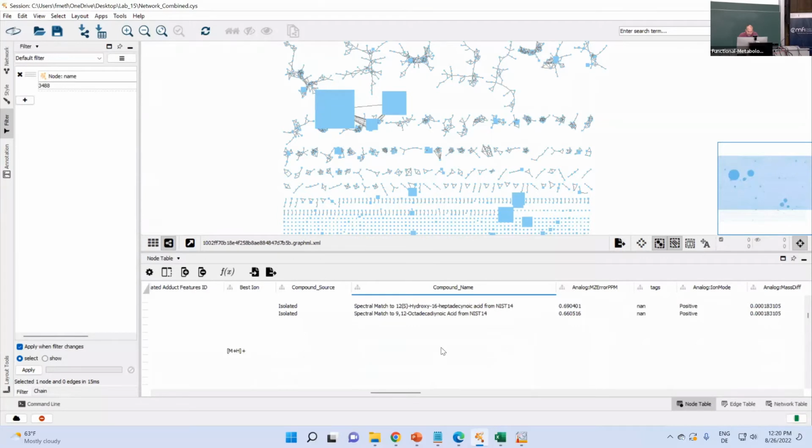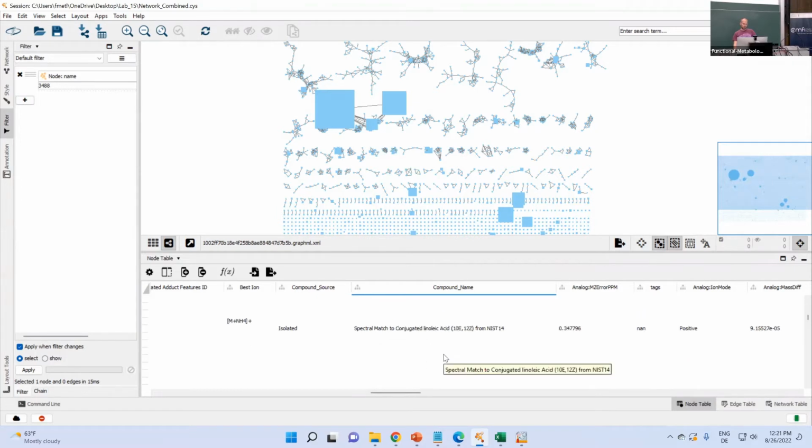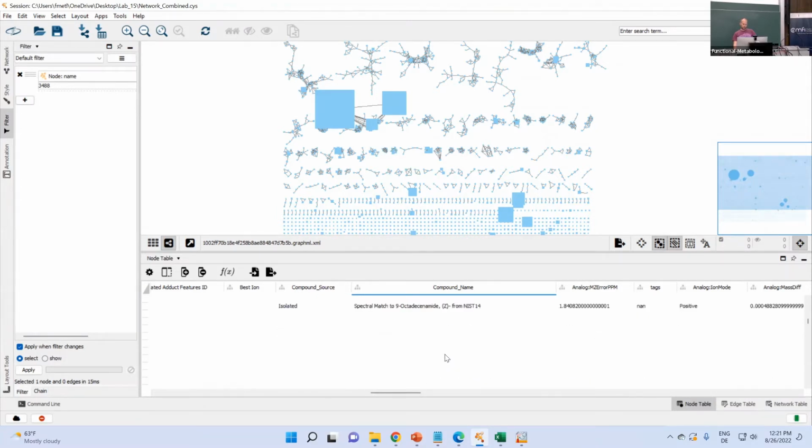So there are other top hits, just flame retardants and plasticizers. How did they get in there at a significant level? That is a very good question. I don't know, but I would assume that because we bought that standard from an algae farm as a reference material, I don't know if they have some coatings on their filters for harvesting it, stuff like that. It could have also obviously been in the background in the ocean water, but then it should not have been such a significant difference. But yeah, there are very few typical natural products from Synechococcus annotated.